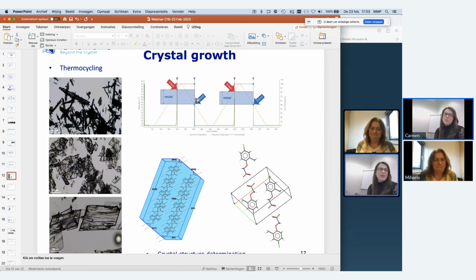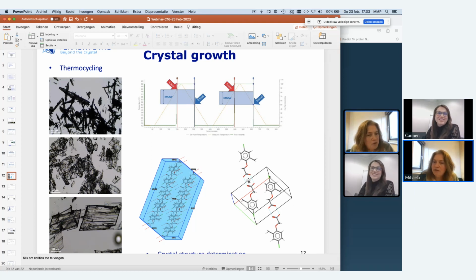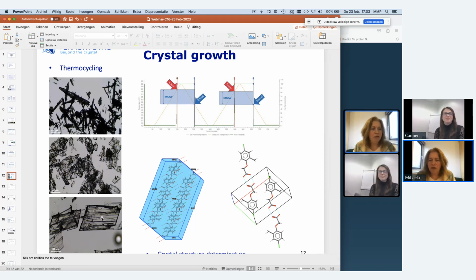Thank you. A more basic type of question: how can we differentiate between salt and co-crystal? A question from Sun Pharma. Yeah, very good question. So single crystal data, I would say, if you have crystals like this, in 80-90% of the cases you are able to see the transfer of proton from a coformer to a compound. So you see where the proton is, and if the proton is transferred, then you can say it's an ionic interaction, so it is a salt. If the proton is not transferred, then it is a co-crystal. There are cases, and we have publications about that.